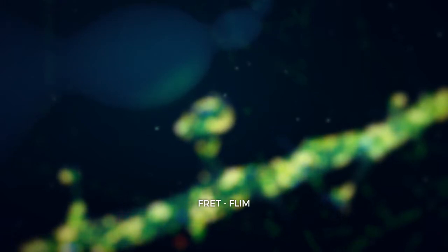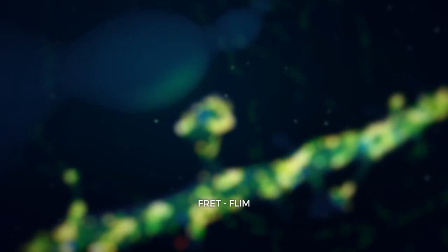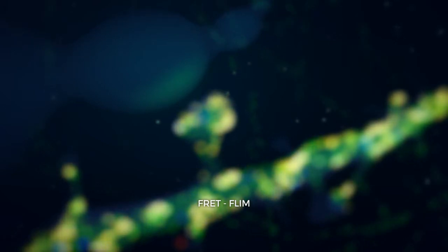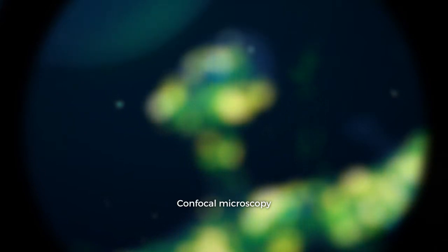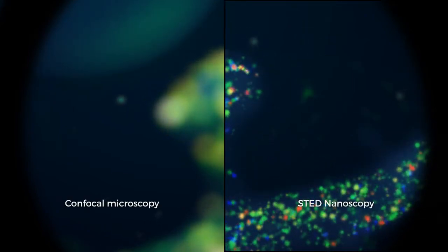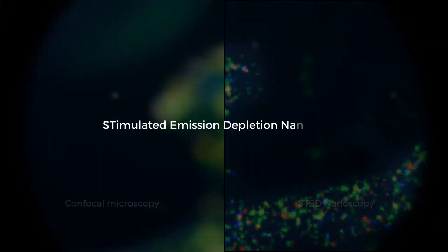However, even though the combination of FRET and FLIM provides quantitative information about the protein interactions, imaging with standard confocal microscopy is unable to resolve the exact location of the interactions within the synapse. To improve the resolution, the traditional confocal microscopy is replaced with stimulated emission depletion nanoscopy, or STED.